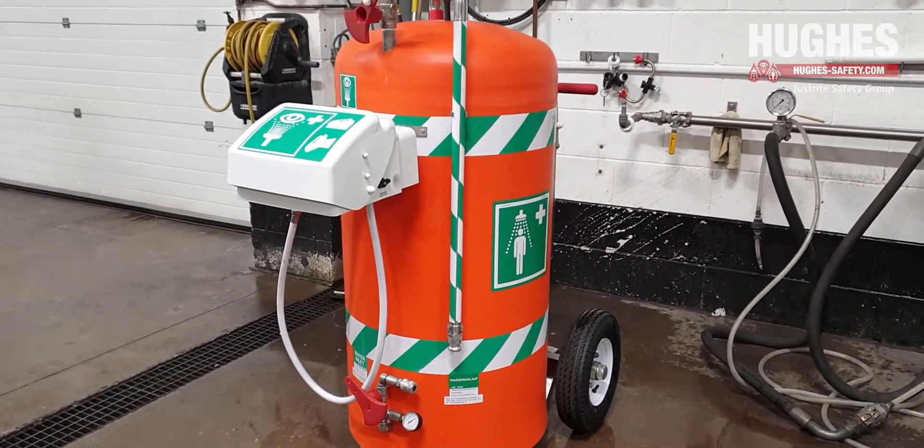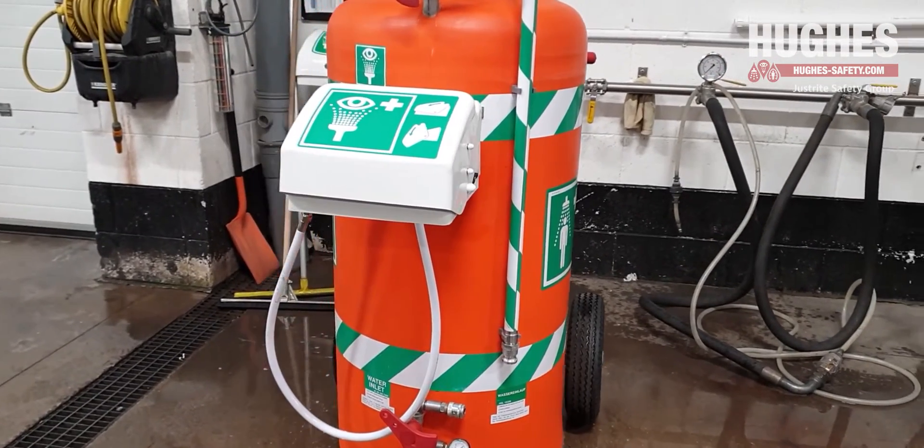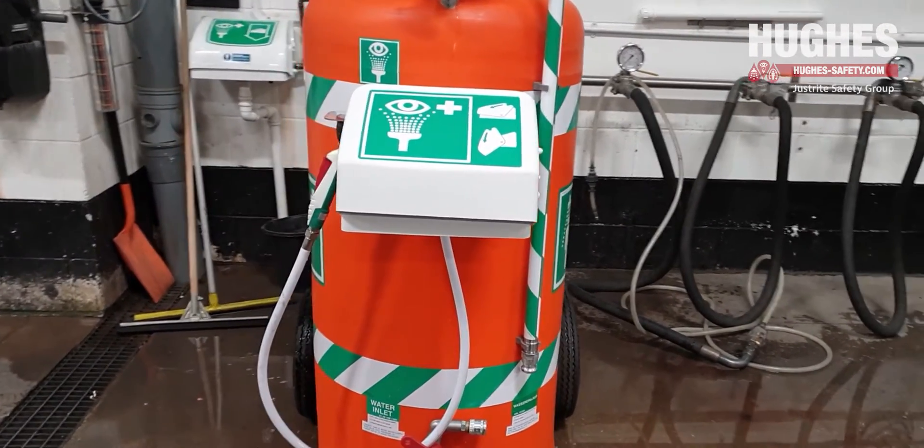These units should be emptied, cleaned and refilled on a weekly basis to ensure correct operation, pressure and water quality.